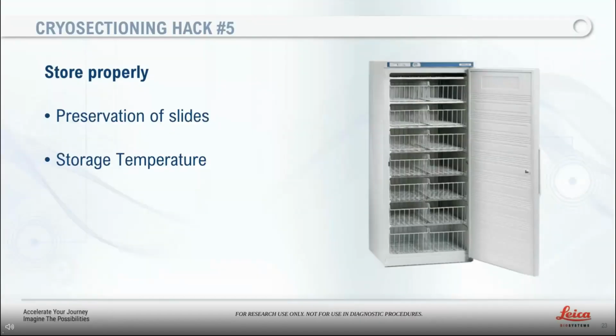And hack number 5, proper slide storage. You may need to revisit your slides. Store them right. If fixation has been done correctly, your slides will remain intact for several months or even years. Temperature plays a huge role in proper tissue storage.